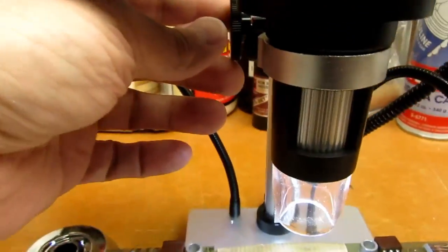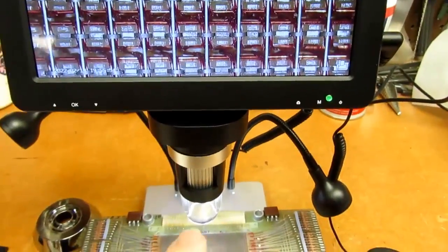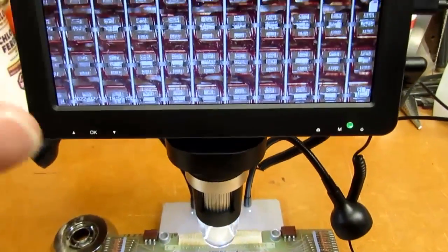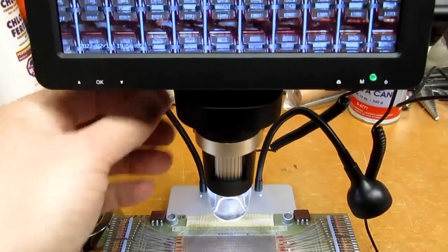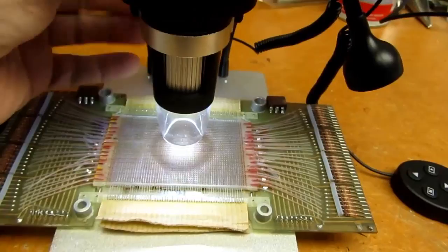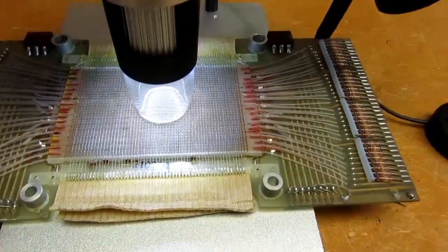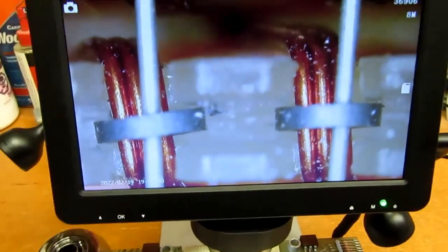Now let's go to get higher magnification. I'm going to grab the wheels on the back and lower this down, but this is not a true zoom feature I'm sure of it, because if it was a true zoom it would adjust the focus automatically as I change the distance between the lens and the objective, and it's not going to do that so it's going to lose focus I'm sure when I lower it. And sure enough it does. Get it right down there, pretty much to the point where it's touching. And now I'm going to have to play with the focus until I get something. Oh beauteous, that's a nice clear image.